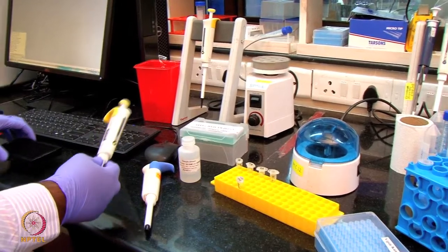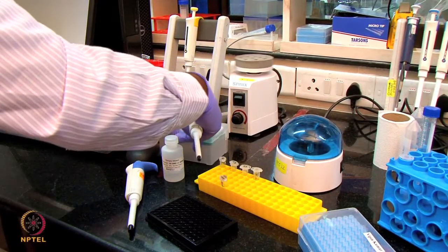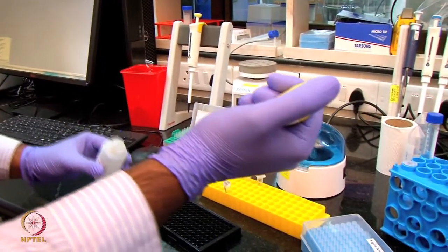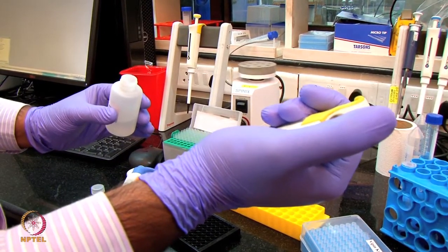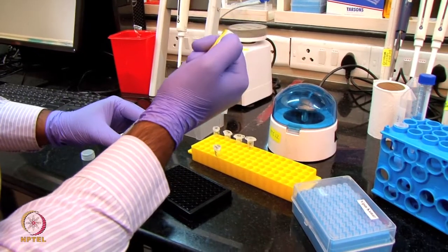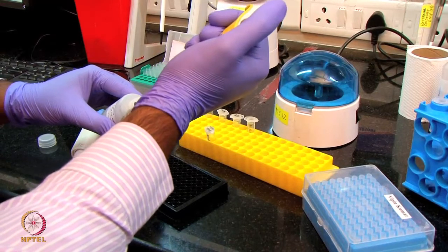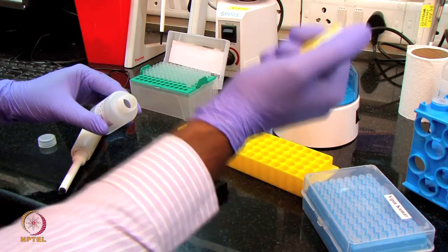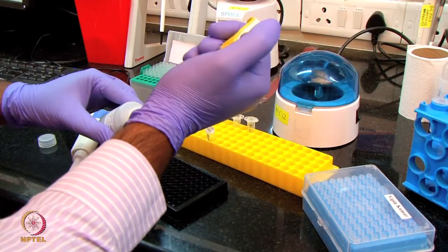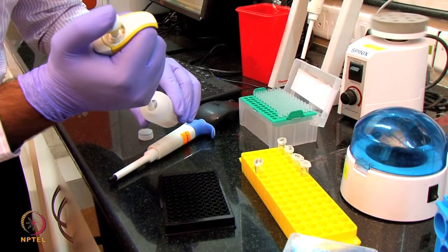Prior to that, I'm taking this 96 well plate and adding the buffer into the wells. I'm going to use around 6 concentrations, two-fold dilutions. So I will add buffer here. I'm going to do the dilution in the plate itself. So 200 microliter each of the sample diluent buffer I'm placing in the 6 wells of the 96 well plate. I'm going to use 3 wells as references, just plain buffer as a reference.